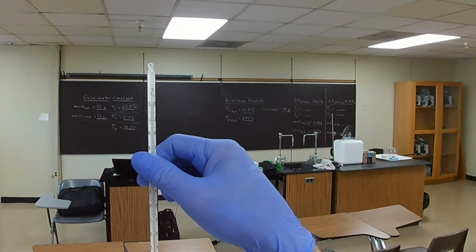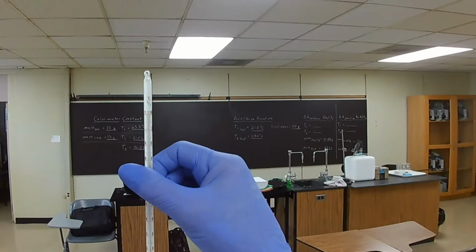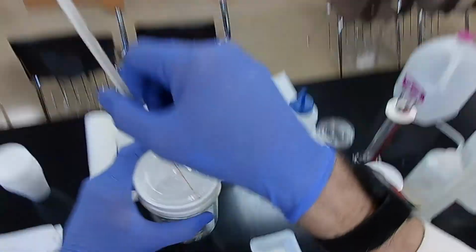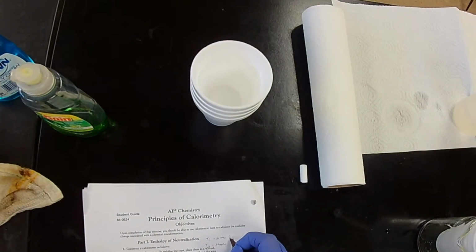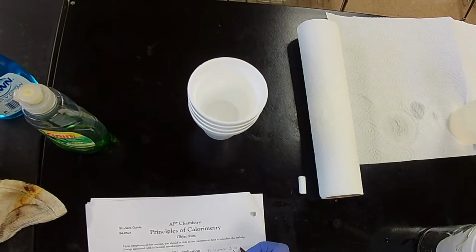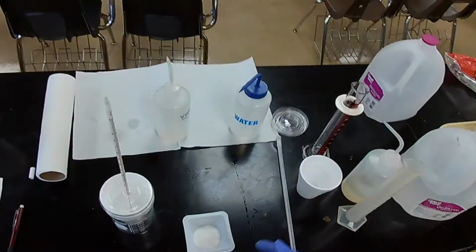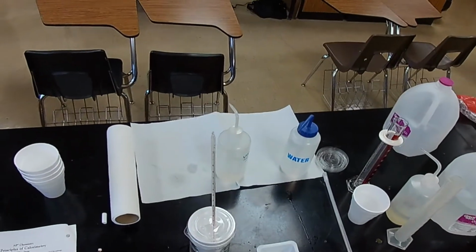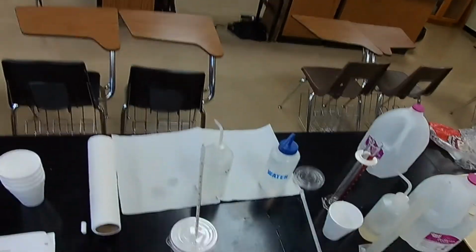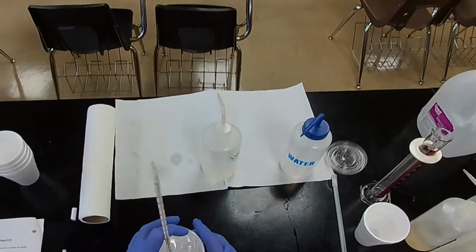It looks like it's exactly 21 degrees. 21.0 degrees, see? Now the final temperature is going to arrive once we've added the sodium carbonate and the heat of reaction either generates heat or absorbs heat. And we'll soon find out which way it is, exothermic or endothermic.